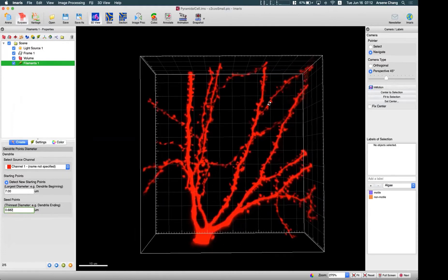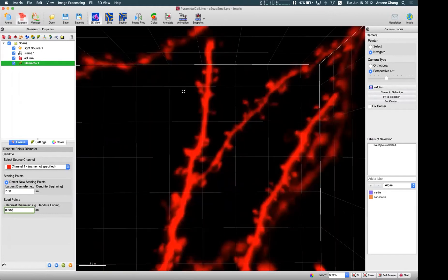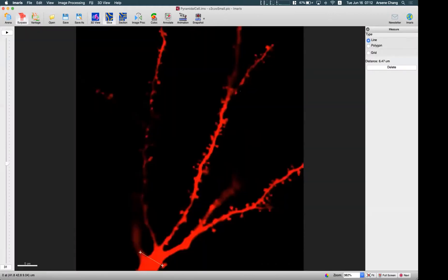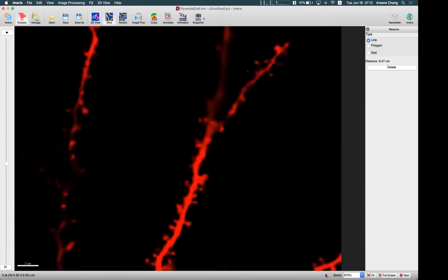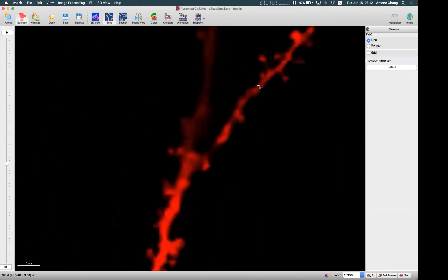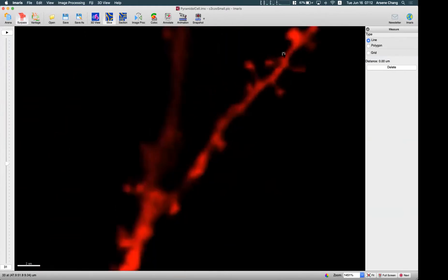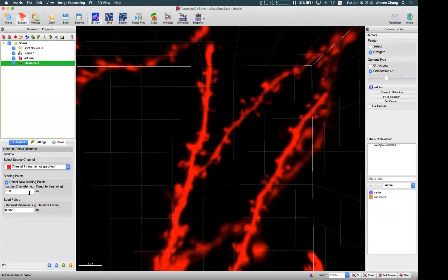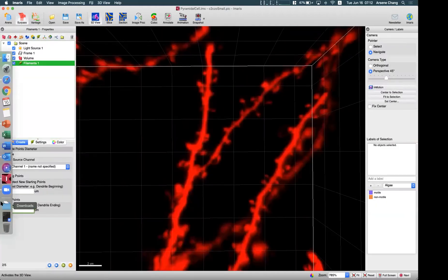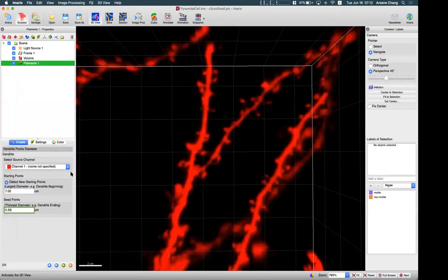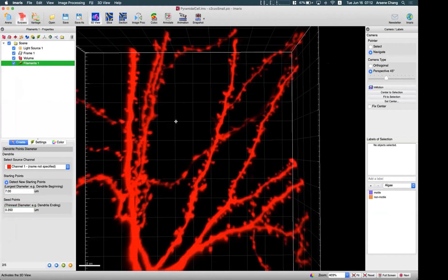For this image, we look at this kind of thin dendrite and measure its size — about 0.3. So I'm going to enter 0.35 to see how it goes.